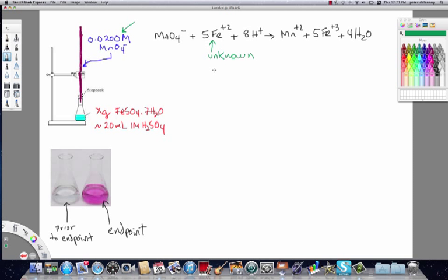Okay, so let's quickly go over the overview of how this is going to work. We set up our experiment the way we did in the last one, the main difference being that now we know precisely the concentration of the permanganate solution. We're given a mass of material in some type of container from the instructor or the professor or your TA, and it's an unknown mass. In other words, you do not know how many grams this is. It's a small amount of material, and what you do with it is you analytically transfer it into the collection flask, as I described in the previous videos.